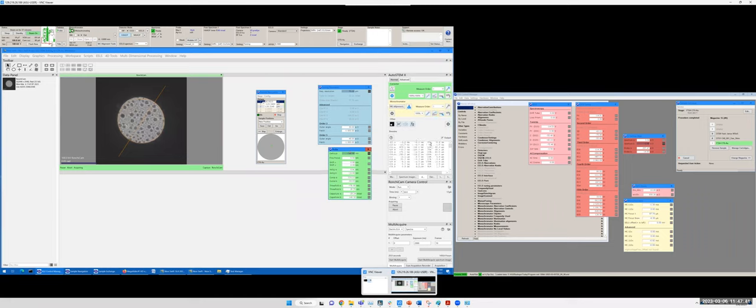Okay, let's look at the values. You can see the third order is still not good. And lower order is also affected. So you can see the residue error. Lower order is very large, so you fix that, and try to make sure it's below 100 for this value. And then try to measure again.